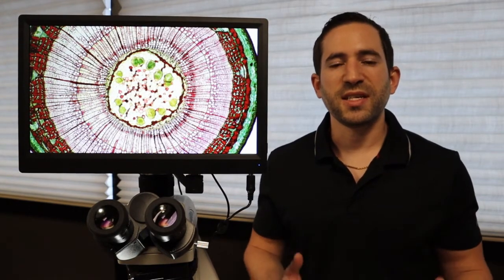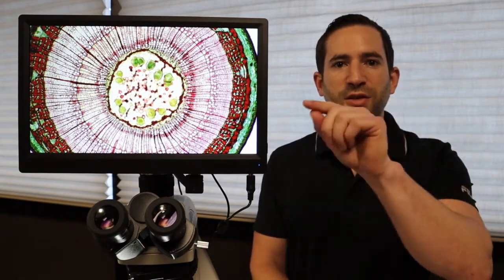This also makes it easier for your on-screen measurements rather than having to touch for point-to-point you can easily click.